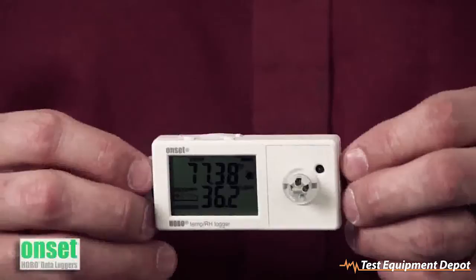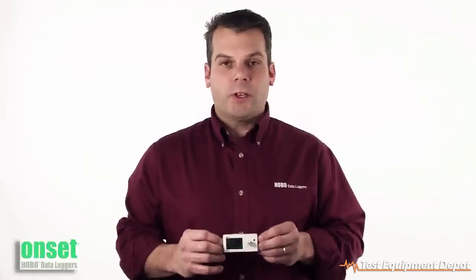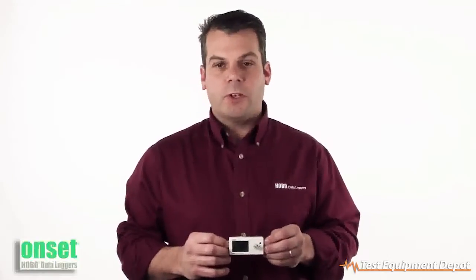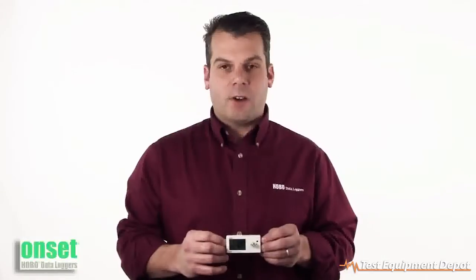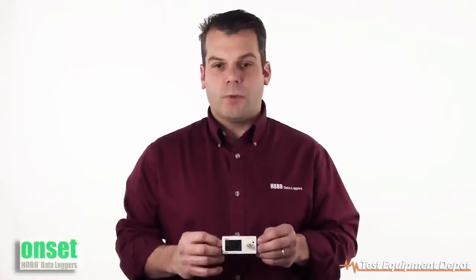It has a temperature accuracy of 0.4 degrees Fahrenheit or 0.2 degrees centigrade. The relative humidity accuracy is plus or minus 2.5%, with a relative humidity range of 1 to 95% non-condensing, and it has the ability to store 84,000 measurements.